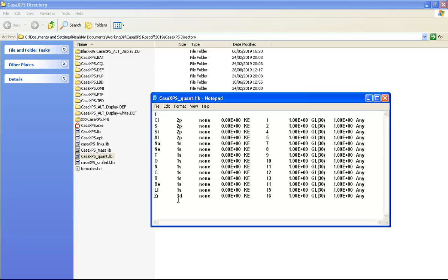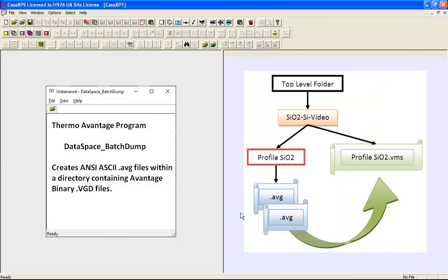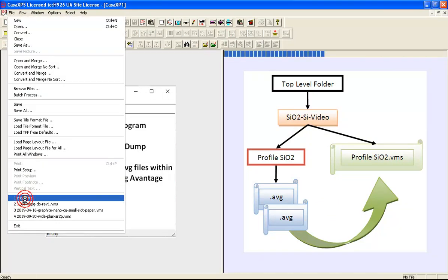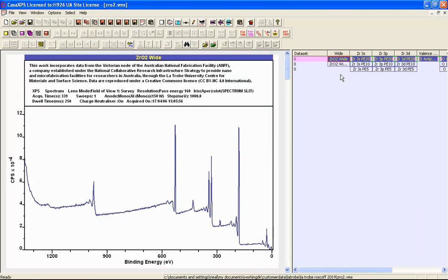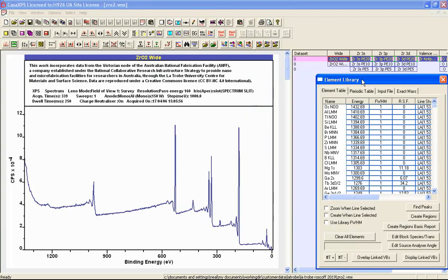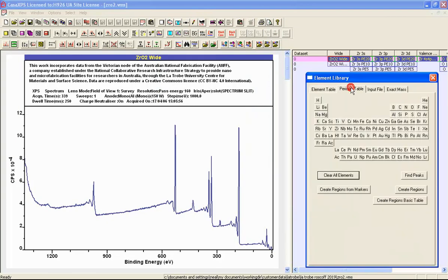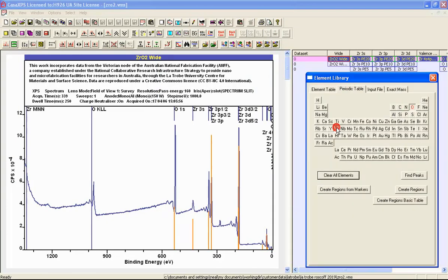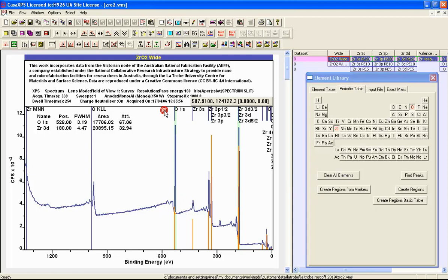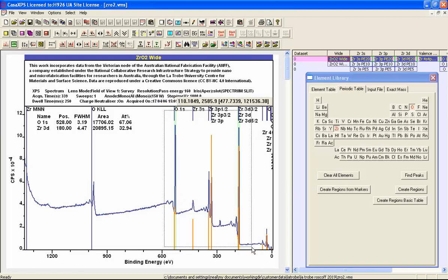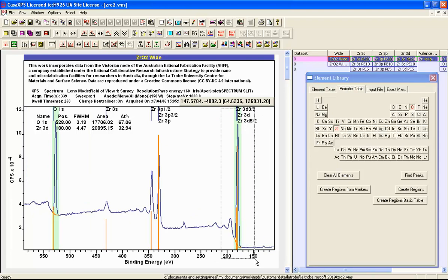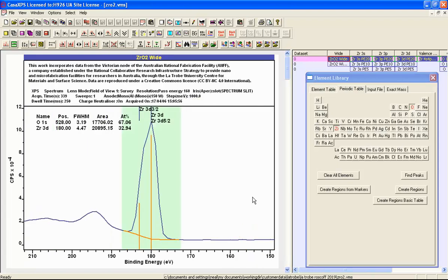If I invoke a new version of CASA XPS and open the same data file, then perform the same process - select the oxygen and the zirconium and then press the create regions button - since I've modified the configuration file, the peak that has been selected for zirconium is now the zirconium 3d, as you can see here.